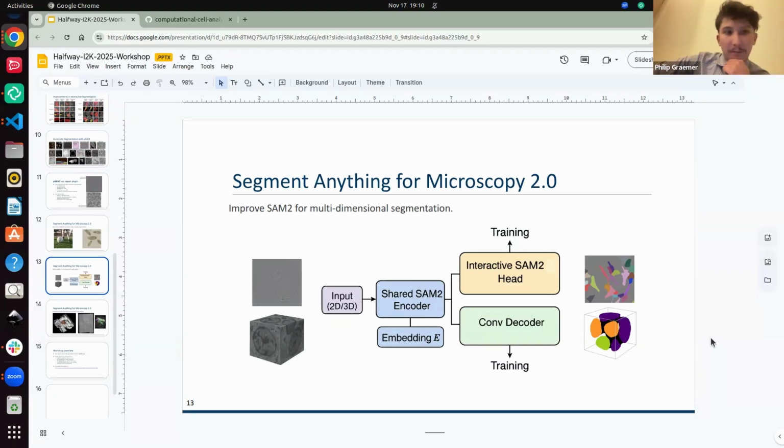And we want to do this not just for automatic segmentation, but for interactive segmentation as well, in a learnable strategy. So until Microsam 1, these are with a post hoc post processing. Microsam 2 is really focusing on, and the manuscript is work in progress right now, making this a learnable strategy so that we can have the context in mind. Because, well, if there's spatial context, why throw it away? Just consider it and learn on it. That's the idea, and we are working on this right now.